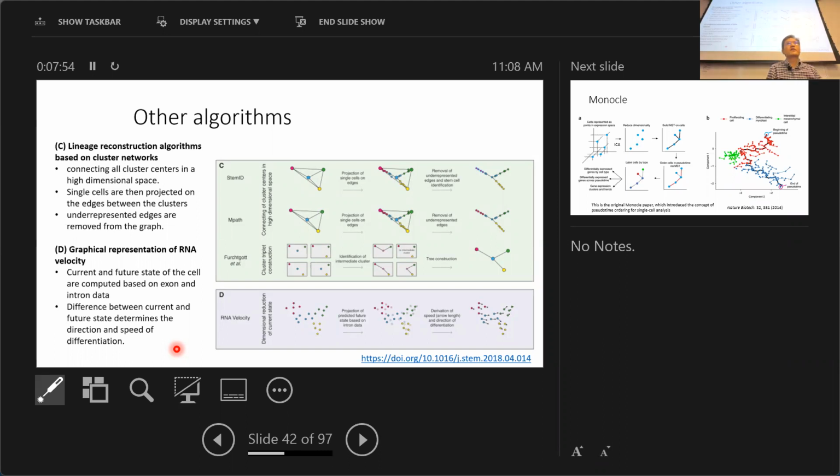For pseudotime analysis, people also have other different algorithms that are scattered around different packages, and RNA velocity can be considered as one of the approaches. In this very special analysis, using spliced and unspliced mRNA signals to assign so-called velocity values for each individual cell.